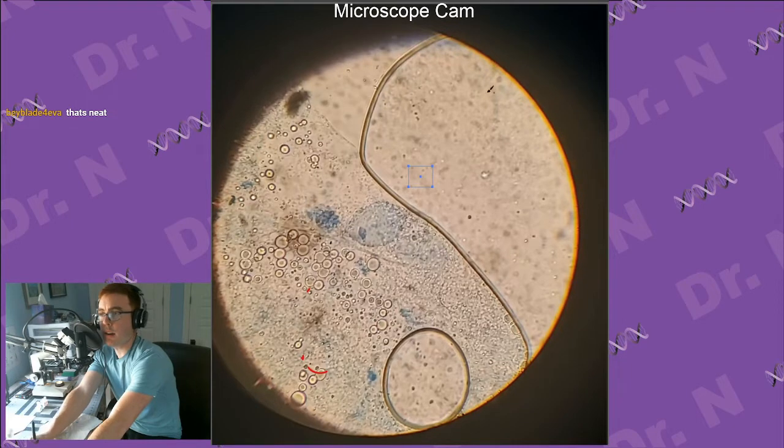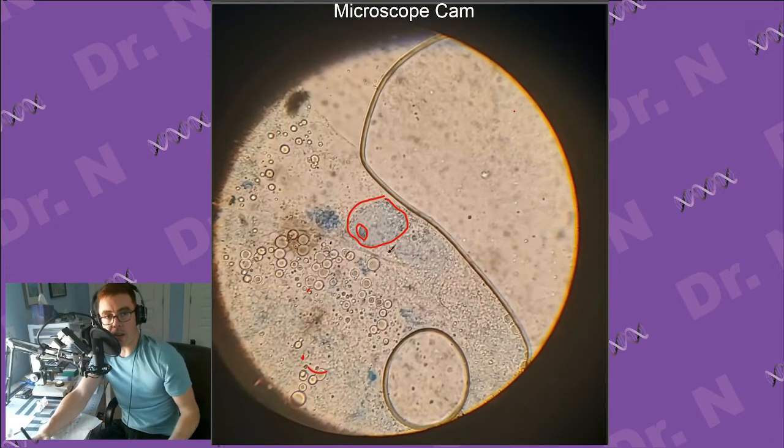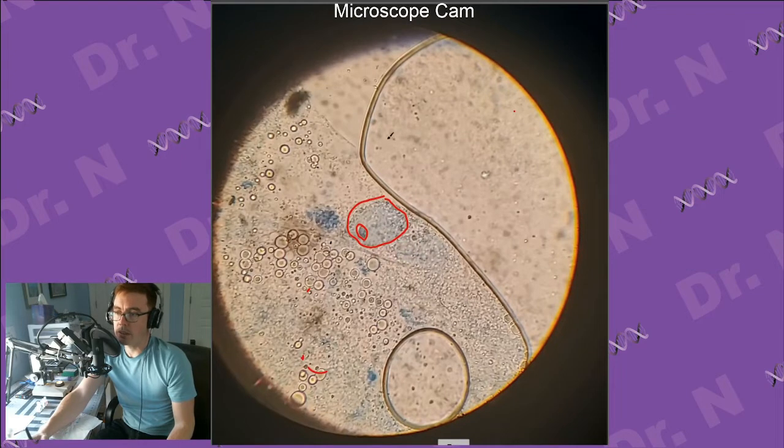Yeah, it is kind of neat. I'm hoping we're actually going to see something interesting. I've drawn a box there. Okay, so right here, that is the outline of the cell, and that is the nucleus. So the nucleus contains all of the genetic information of a cell. So this is one right here that we've found. If I can get my pen to work, just erase that.